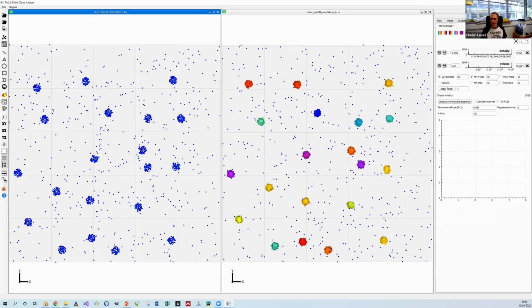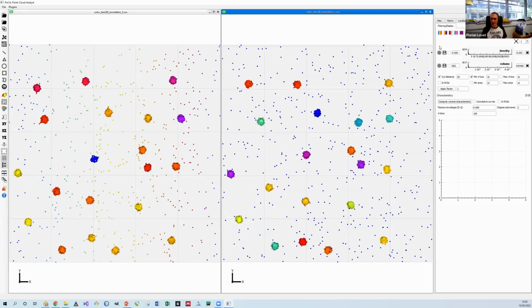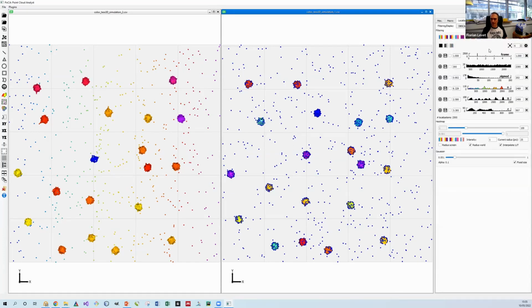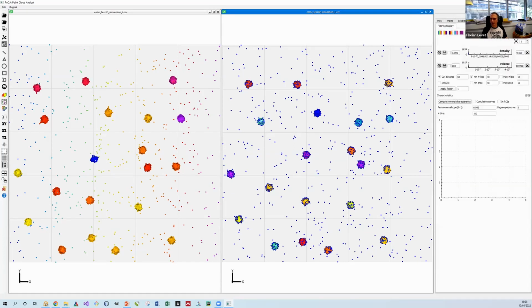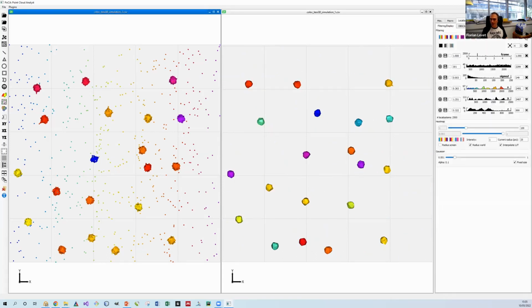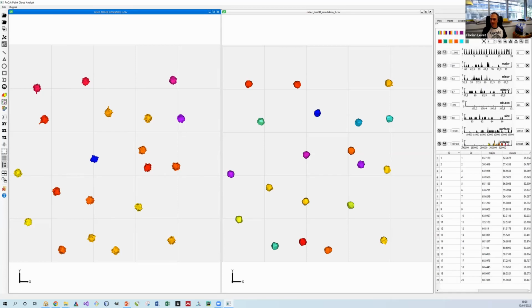Here I will create some objects. So I have my objects. I will get rid of displaying the localization. I think I have the Voronoï. Okay, here I don't have the Voronoï. Don't display that, and I don't display that. Okay, so I have my two objects.